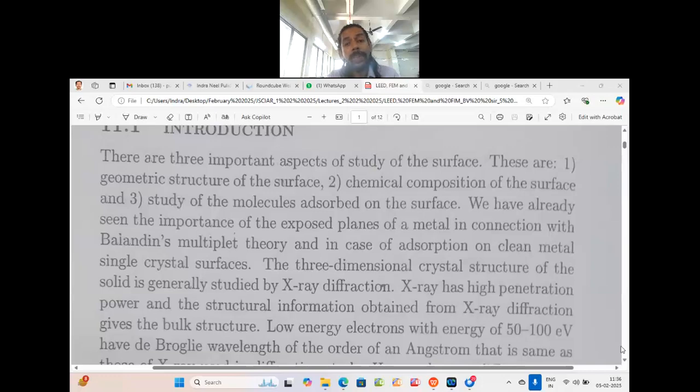Electron spectroscopy is different. Electronic spectroscopy is different. This is how we need to be careful in distinguishing one technique from the other. Electron spectroscopy deals with using photons as the energy source to probe the surface, and these photons will penetrate into the core of the atom, to the electron at the innermost shell, the core electron level.